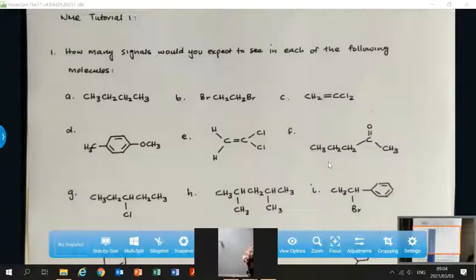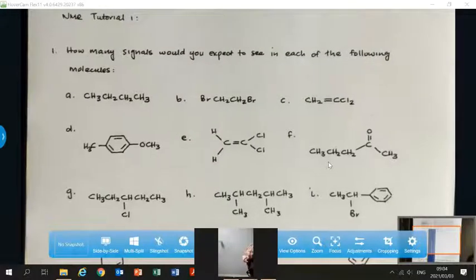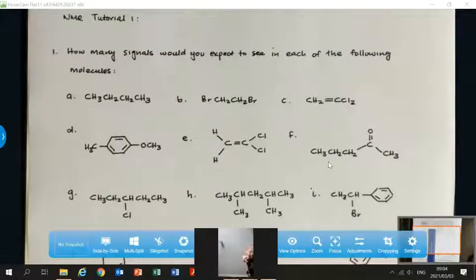And remember, when we deal with complex molecules in the higher years, we get a lot of overlap, and in a lot of cases the overlap that we see sometimes muddies the water, and we don't really have an easy way of solving the structures.